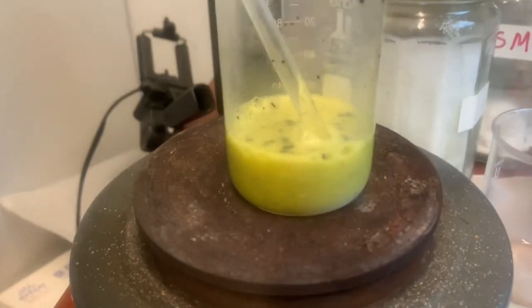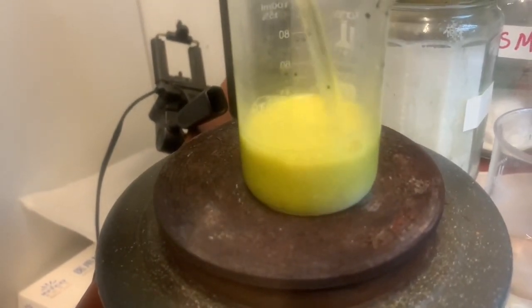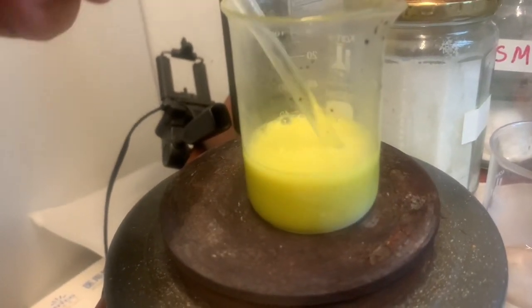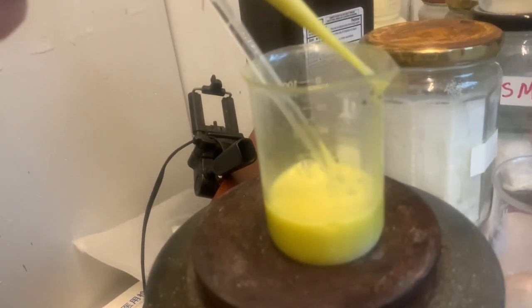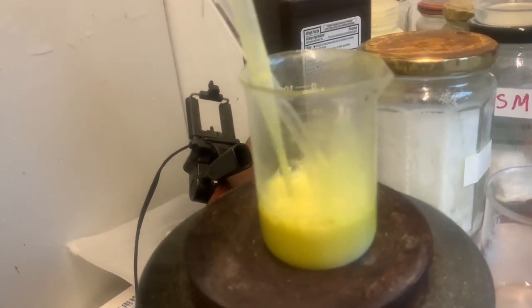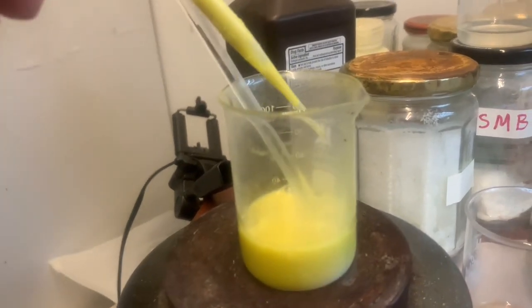You see how muddy this stuff? Because this is his little sand, is a lot of stuff in this colloidal gold. But what to do? This is not a lot of gold, guys, too, you know? And just colloidal gold looks like a lot, but actually there is very little.